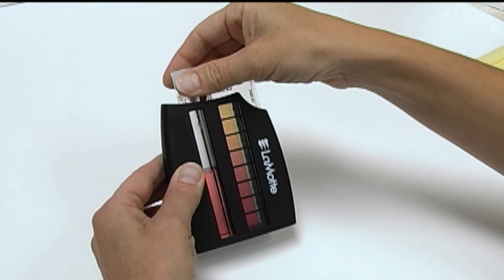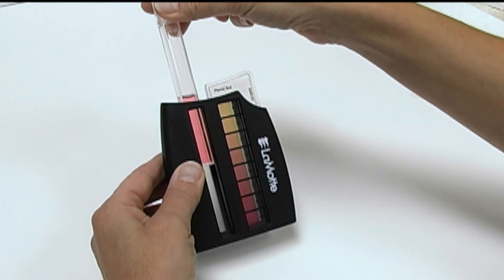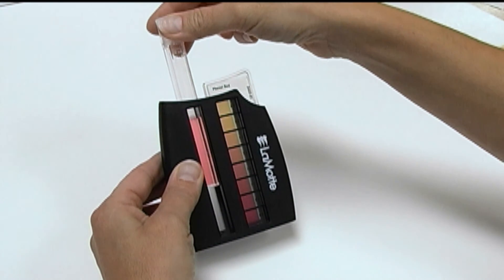Most Octaslide II procedures use a 10 mL sample, but if a 5 mL sample is being treated, simply lift up the tube to compare the reaction to the standards in the top half of the color bar.